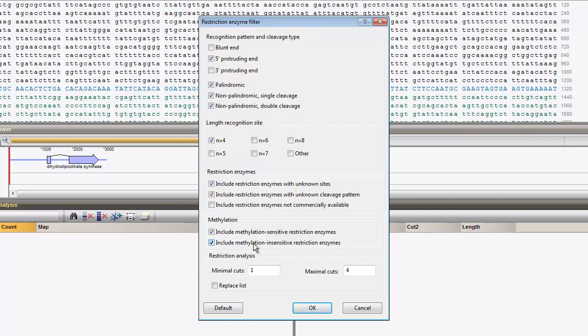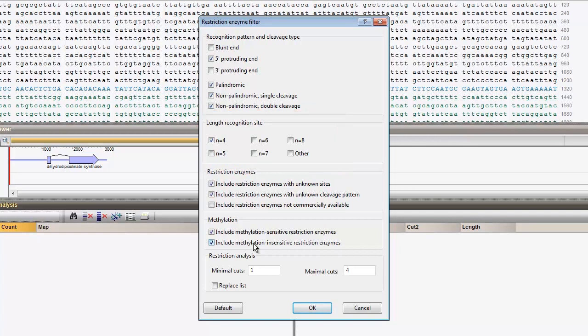In the Length recognition side panel, check N equals 4 and uncheck all other options.